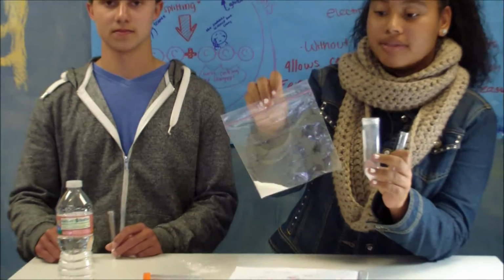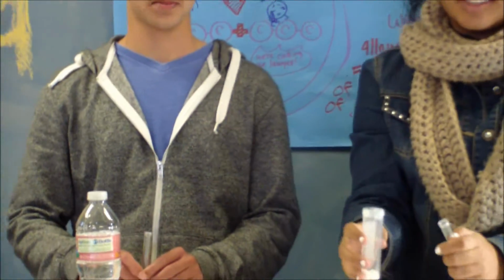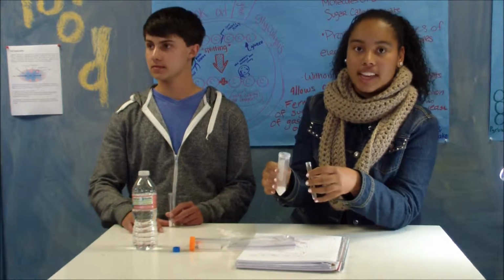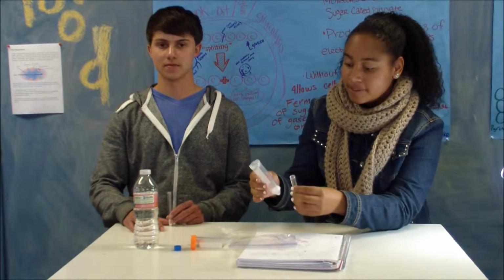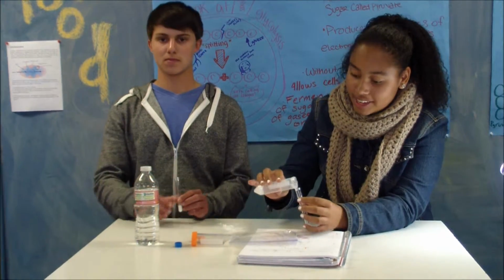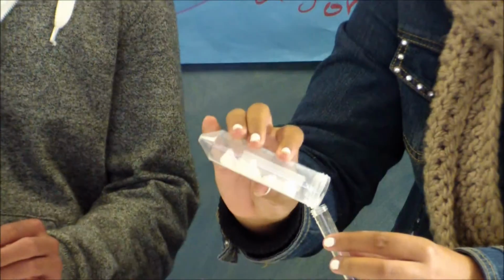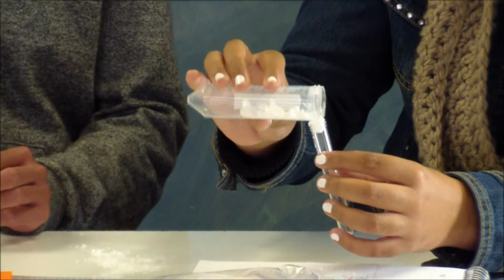Guys, today we're going to be doing a cellular respiration experiment with baking soda, sugar, and water. And this will conduct a fermentation through the process of glycolysis, and you'll see how this is in just a moment. Now Anthony already has baking soda in his test tube, and I will be pouring some into mine.